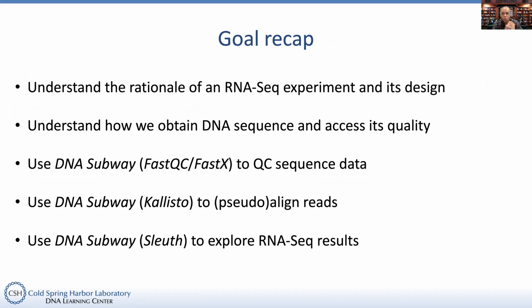Looking back at the learning goals, to recap, I hope you got the hard details and the broad concepts down. Maybe those two things are counter to each other, but let's just stick to the high-level takeaway that an RNA-Seq experiment allows us to interpret something about how gene expression may be happening in the cell. We use high-throughput sequencing, in our case Illumina, to get those reads, and we often need to do some cleaning to make sure we have good quality data.